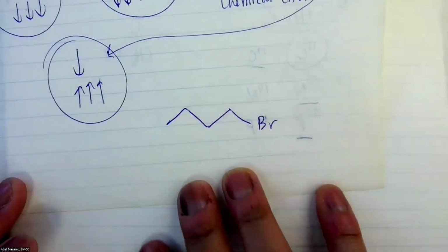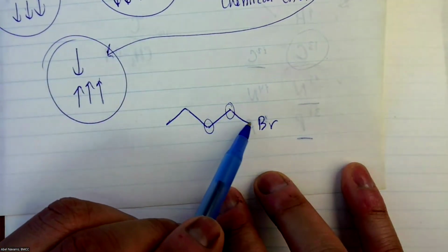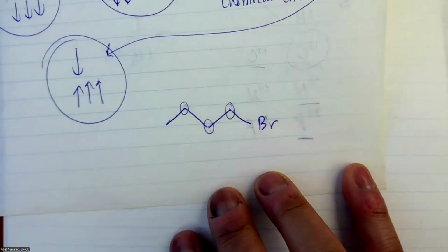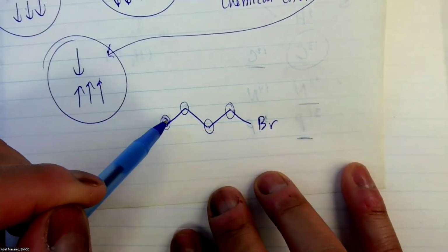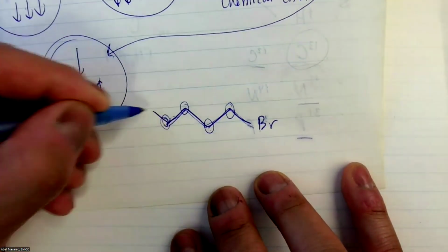Okay, so another case, you have put a bromine there. Of course, that signal is going to be different from this signal. Why? Because this signal is right next to the bromine. This signal is 2 atoms away from the bromine. This is even worse, because it's very far away. 1, 2, 3, 4 bonds away. No, the hydrogen is here.